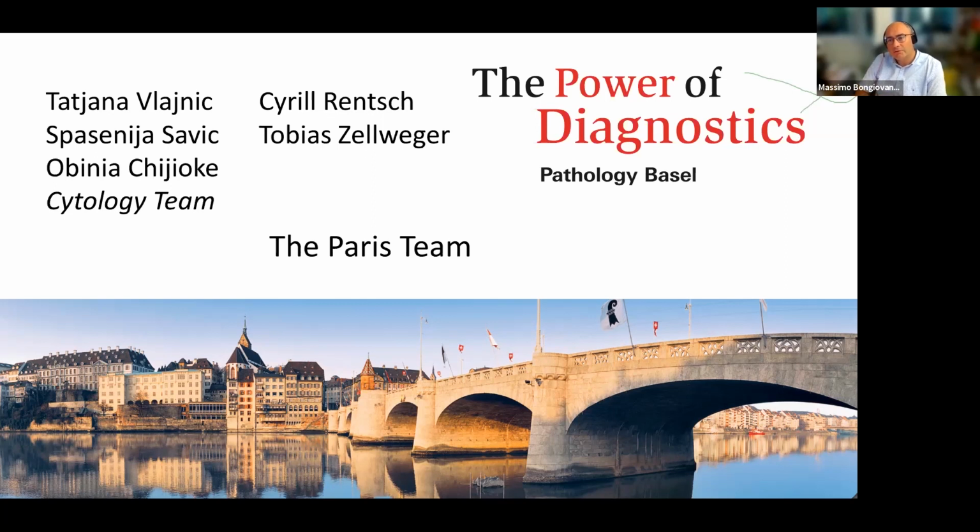What is your approach? Well, that depends really on the lab where you work. So we do all the immunocytochemistry on Papanicolaou stained specimens. So in case of the bladder, we use just the Papanicolaou preparation that we have. We uncover it and stain it with our protocols, and it works.